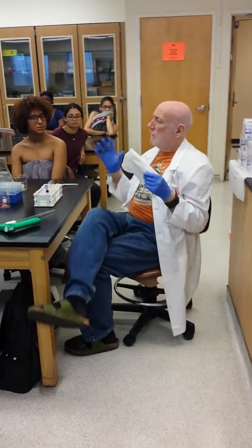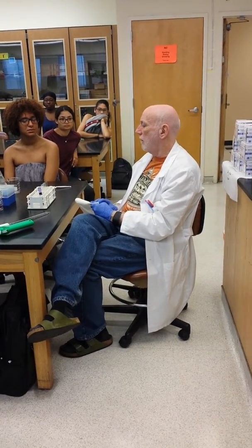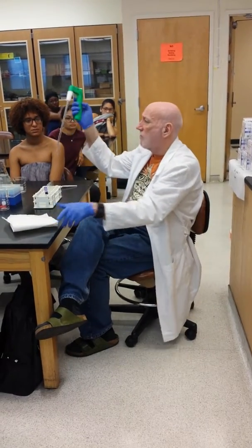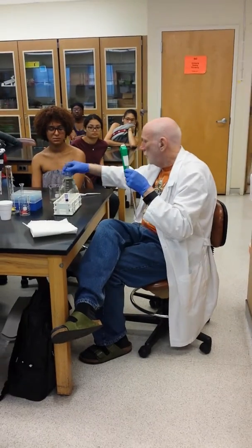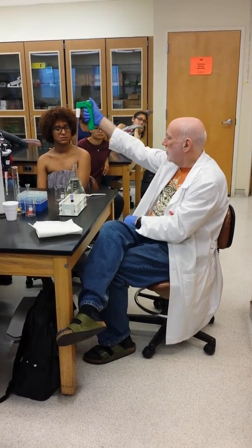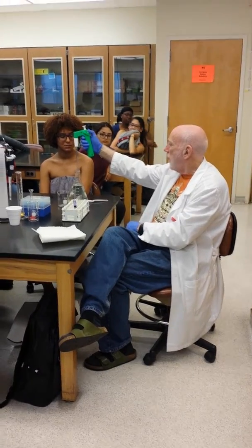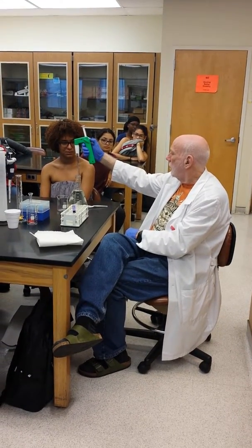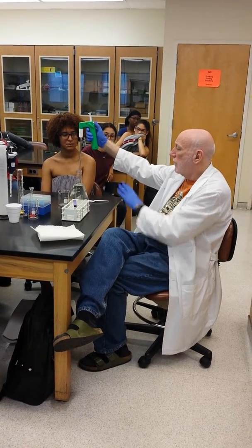Now I want a 10th molar solution. How can I get a 10th molar solution? And I'm going to use an instrument here. This is a pipette. Suppose I want to draw some liquid, a known volume of liquid. You're all going to get a chance to use these pipettes during the semester. It's no big deal. I'm going to measure out a certain volume of liquid. Let's say it's water.